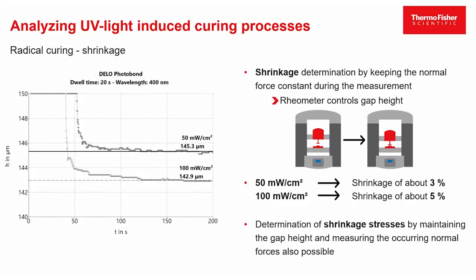Furthermore, when not only controlling the gap height, but measuring the occurring normal forces, one can also determine the shrinkage stresses that are occurring throughout the curing.